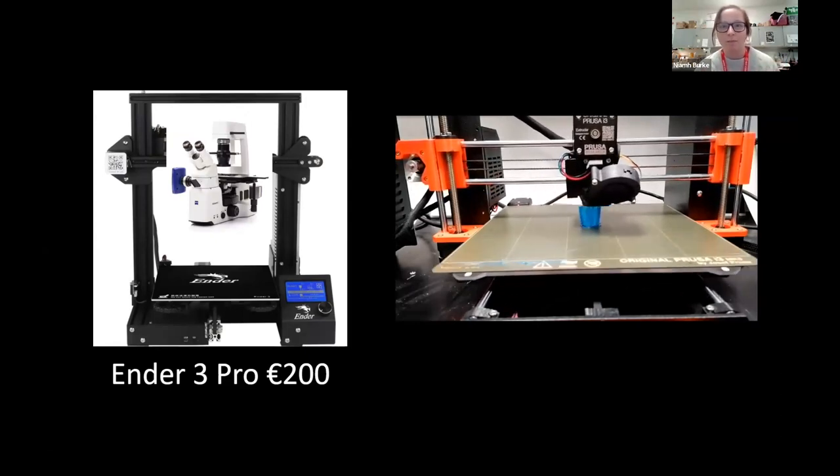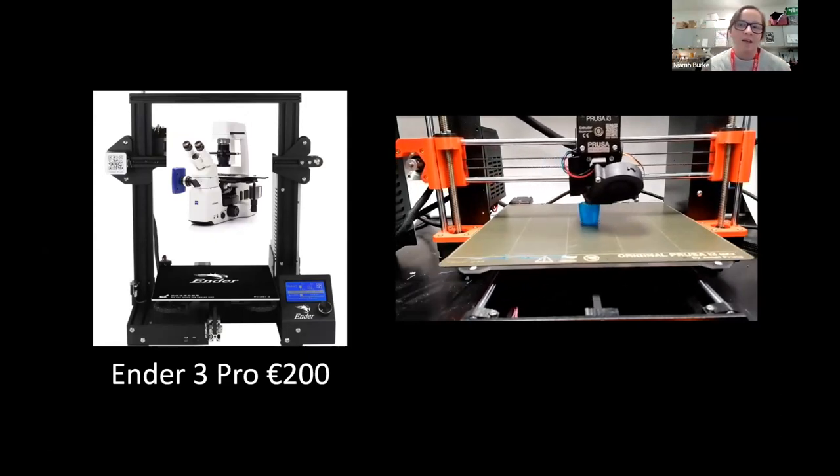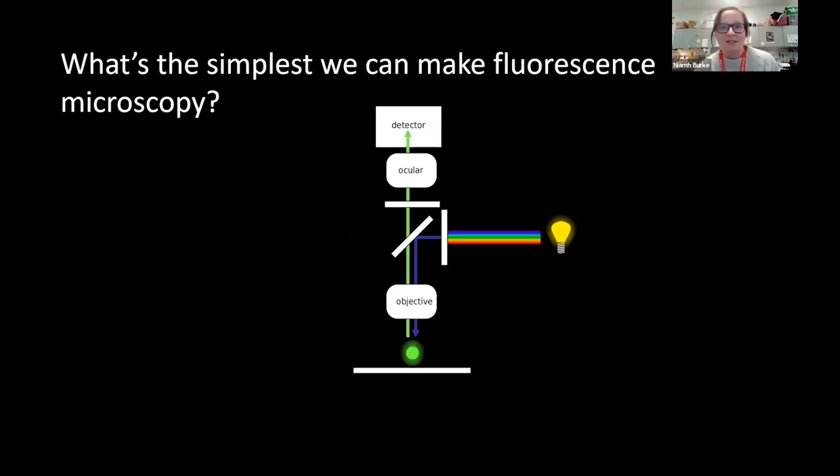What is the simplest that we can make fluorescence microscopy? So fluorescence, here's a schematic of what fluorescence is, and it looks really complicated but it's actually really simple. Fluorescence is where you shine light of a certain color onto the sample and you measure a different color coming back off the sample. Really, if you want to do fluorescence microscopy, you only need four things.